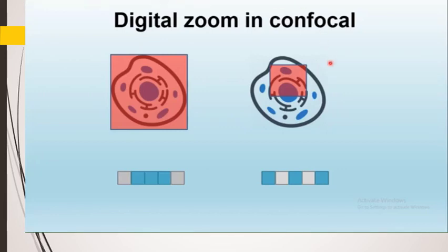For example, let's say there are 3 pixels very close together. Now if we increase the number of pixels by projecting the image into a bigger frame, then there are more gaps between them. That increases the resolution.